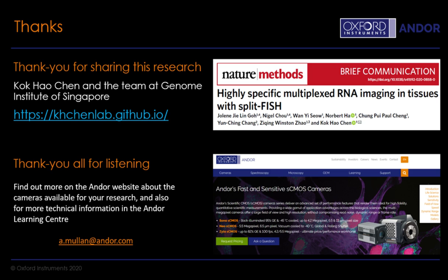Would adding tissue clearing to this technique provide any further benefit? Yeah, I think it will, in the sense that it might further improve the signal to noise. It can, for example, reduce noise associated with the autofluorescence, like from protein or lipid.